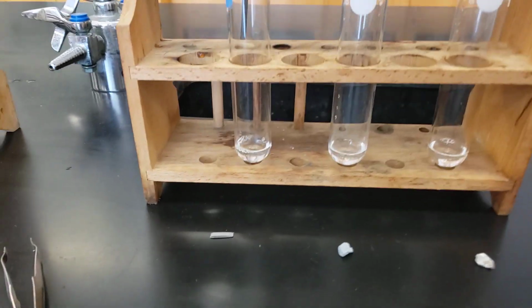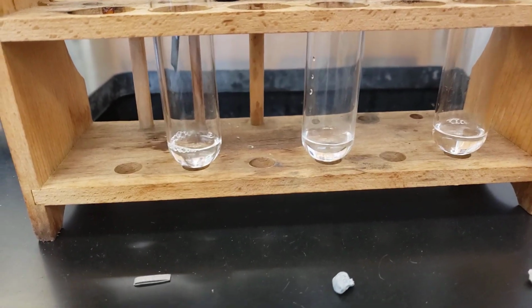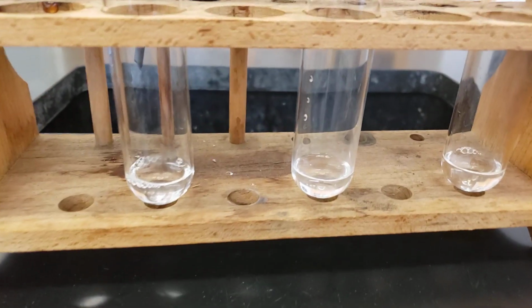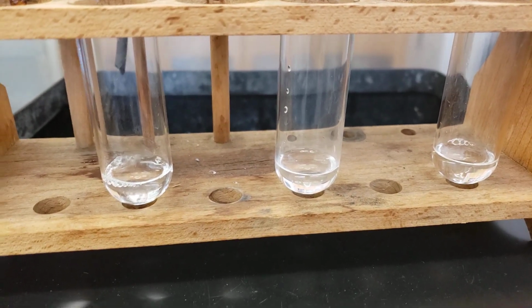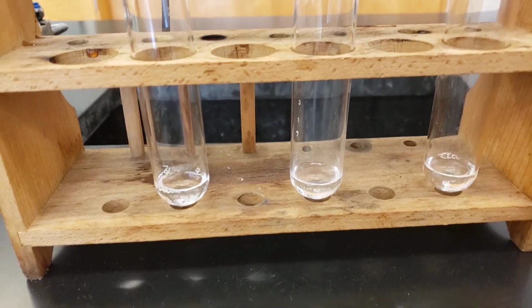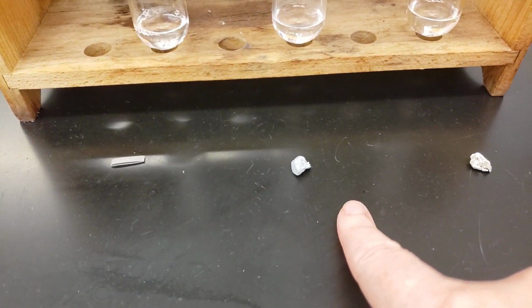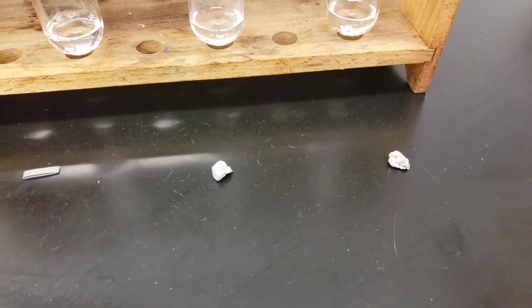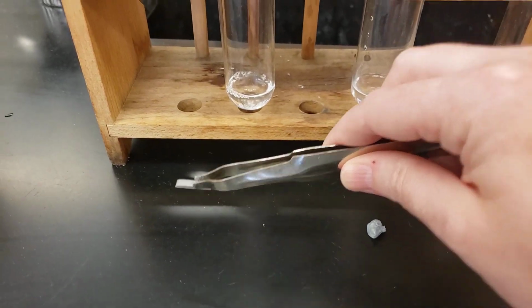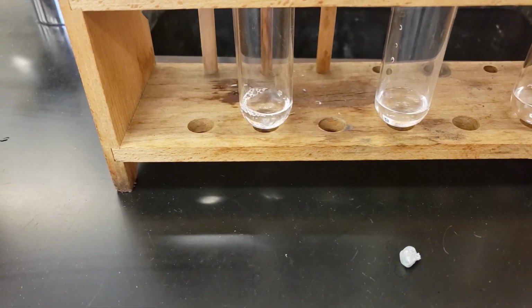Moving on to part 2 of the lab, we are now investigating the reactivity of some metals, this time in hydrochloric acid. So I have 3 test tubes, each containing hydrochloric acid. Now we're going to review the reactivity of magnesium, zinc, and tin in our hydrochloric acid. So let's do magnesium again. Hopefully it's a little more exciting this time.